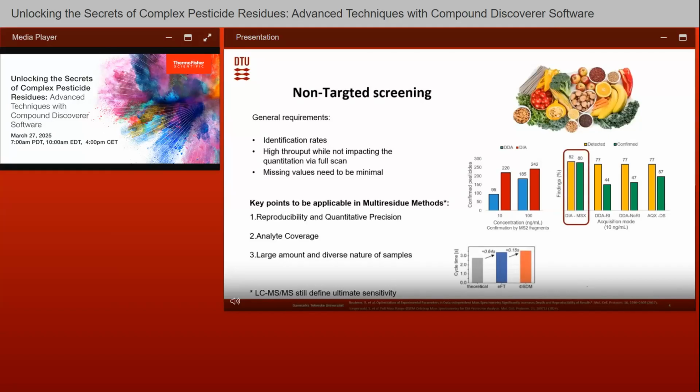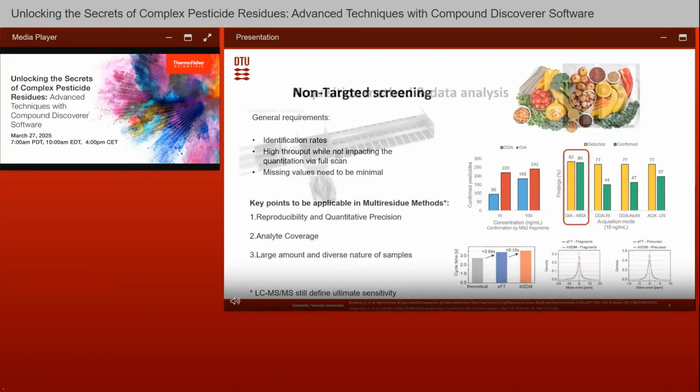I think I'm not alone in feeling that DIA could completely take over DDA in the future, as new algorithms efficiently assist in making DIA windows as narrow as possible without impacting either the cycle time or the accuracy of precursors or products.